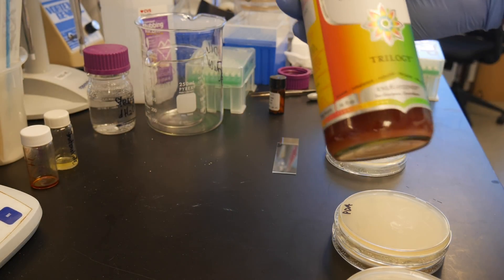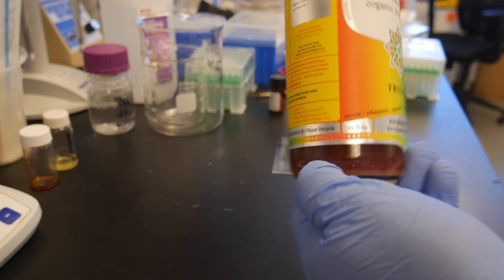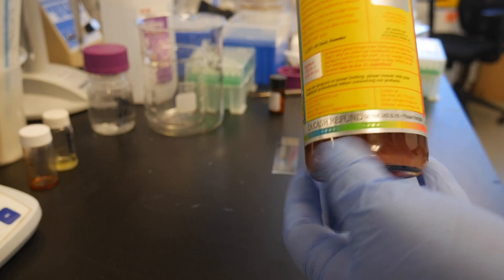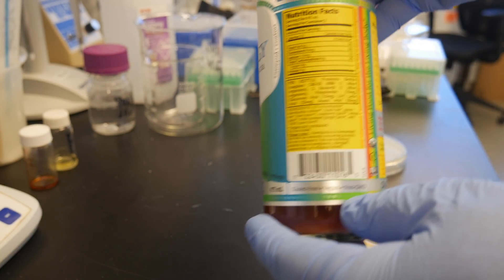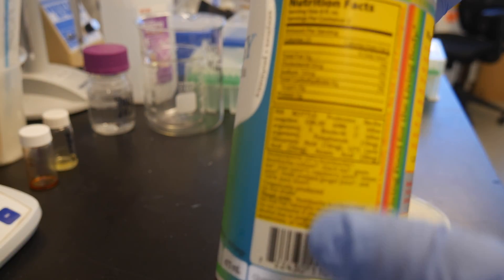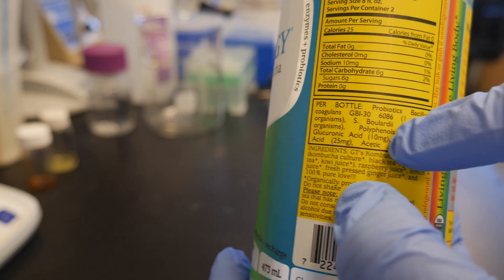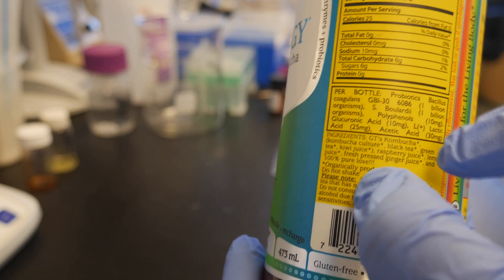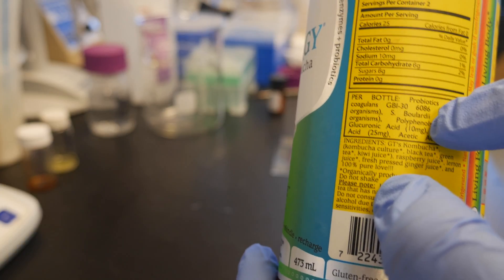Today we're going to culture and see what is inside of kombucha. I bought this at the store for four dollars. It's flavored with juice because I don't like the original one. If you look on the back of the label, you'll see that the main organisms inside are Bacillus coagulans and Saccharomyces boulardii, which is a yeast.